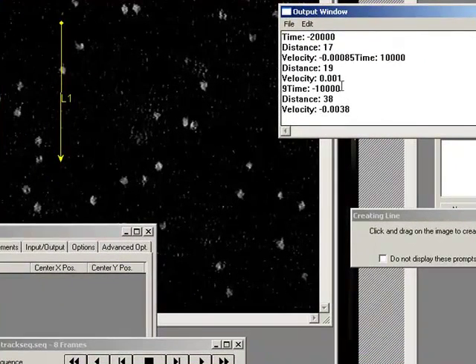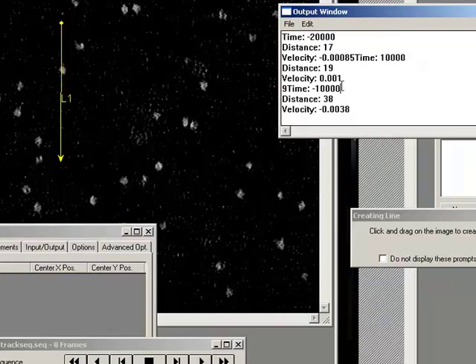The time information needs the header information in the file to work properly. But it's a pretty straightforward macro. If you need any more information on this, please contact your sales office or local dealer. Thanks very much.